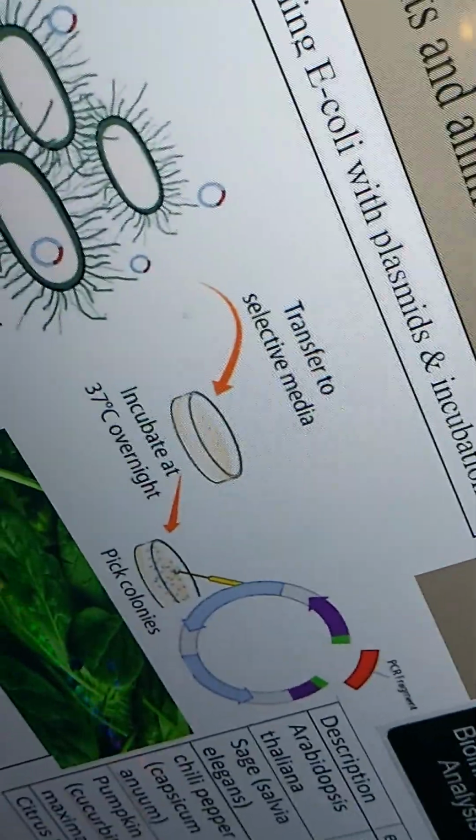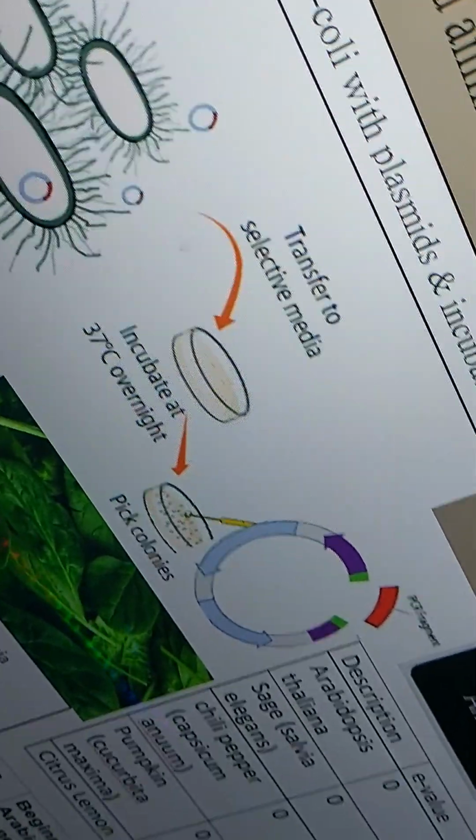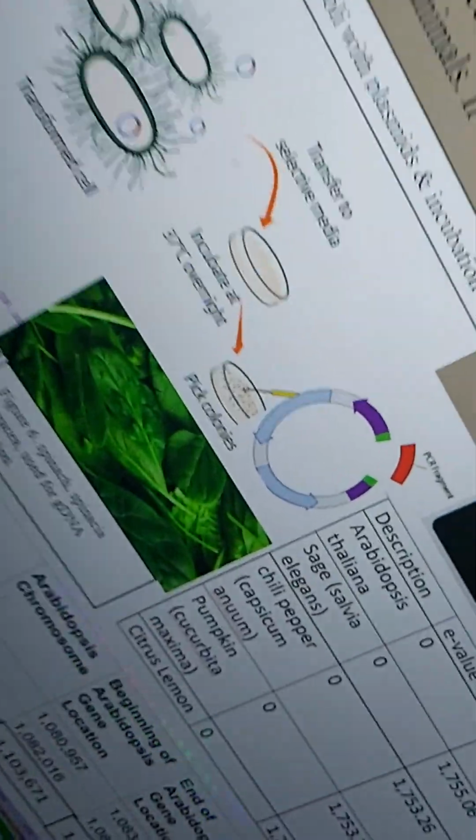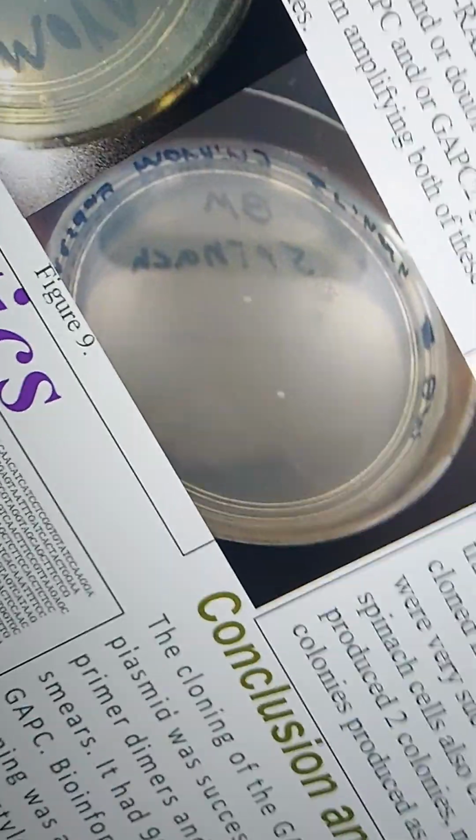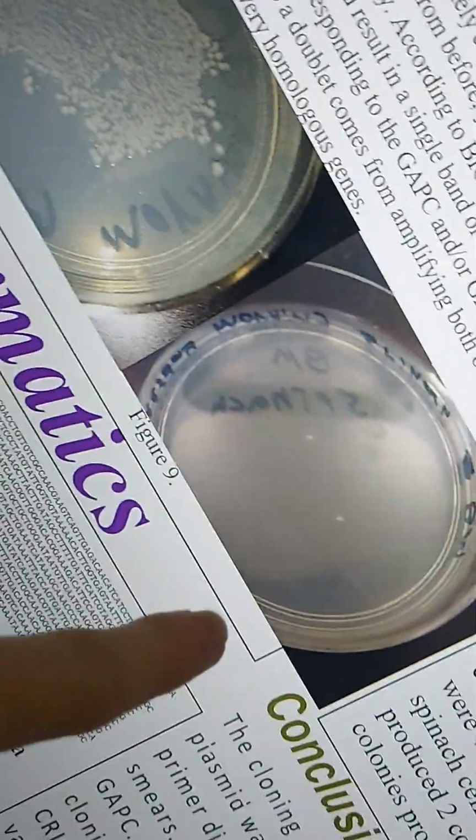You transfer it to the selective media, which you incubate overnight. And then you can pick your colonies, which we have then done. So you can actually see the results of this over here. This one only produced 2 colonies. 2 colonies, which is, it's not very good.